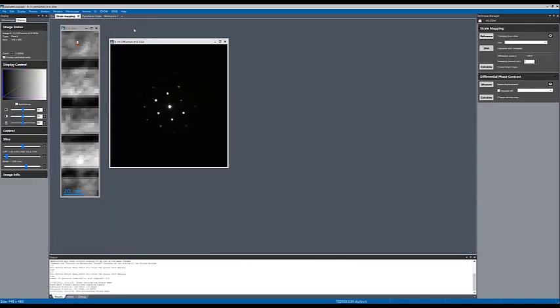My next data set is going to be for DPC. I would also like to mention that in DPC, especially for magnetic field measurements, what you are trying to measure is actually the movement of the beam. You have a large convergence angle, you look at the 0 beam, and you want to measure how much the beam is being deflected because of the field in the sample.